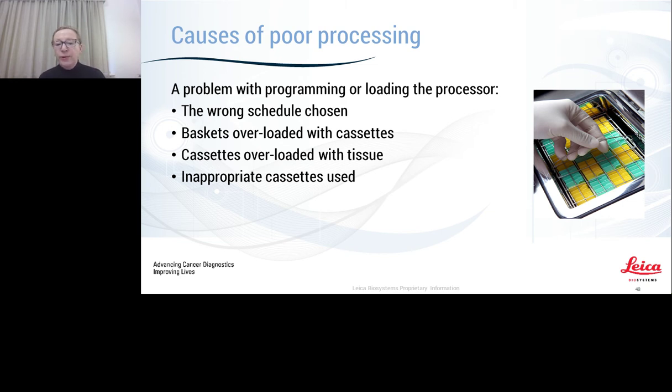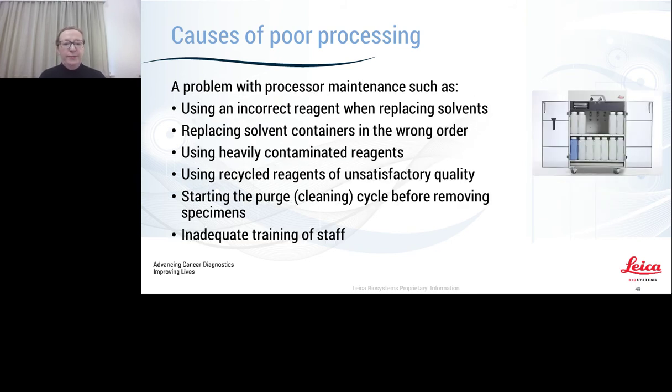There could also be a problem with loading a processor. The wrong schedule is actually chosen. How do people know which is the correct protocol? Make sure your protocols are named very clearly. The baskets may be overloaded with cassettes, the cassettes overloaded with tissue, or inappropriate cassettes used. You saw earlier that there are different cassettes. Some will be mesh, some will have larger holes. Think about your choice of cassette. Must support the tissue, but you may use other things like papers or biopsy pads and keep the same cassettes just so that you get consistent movement of fluid.